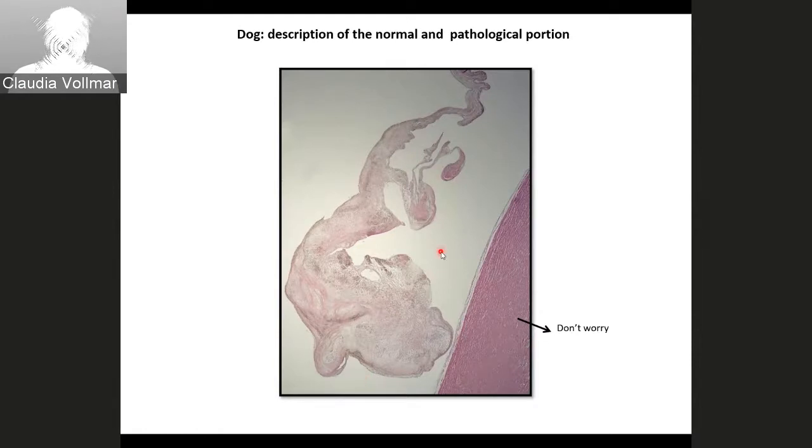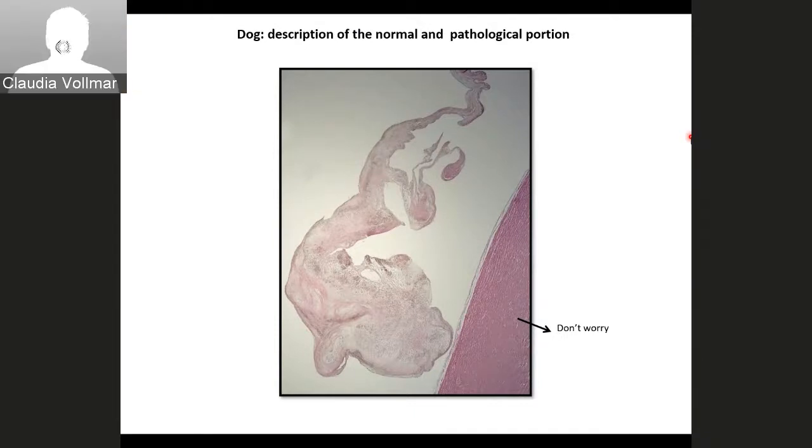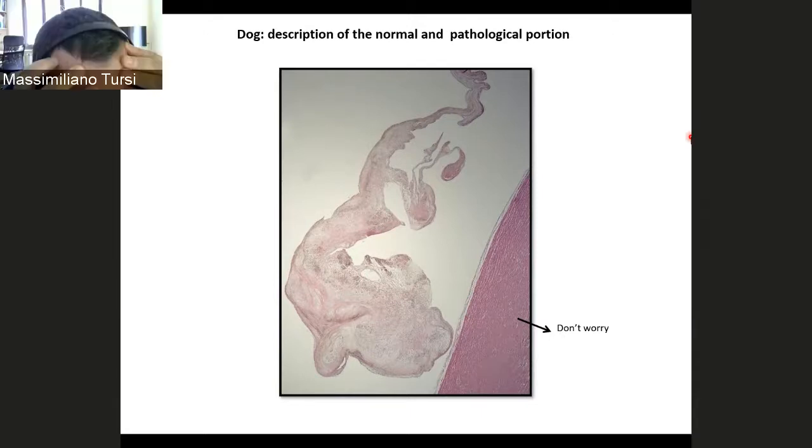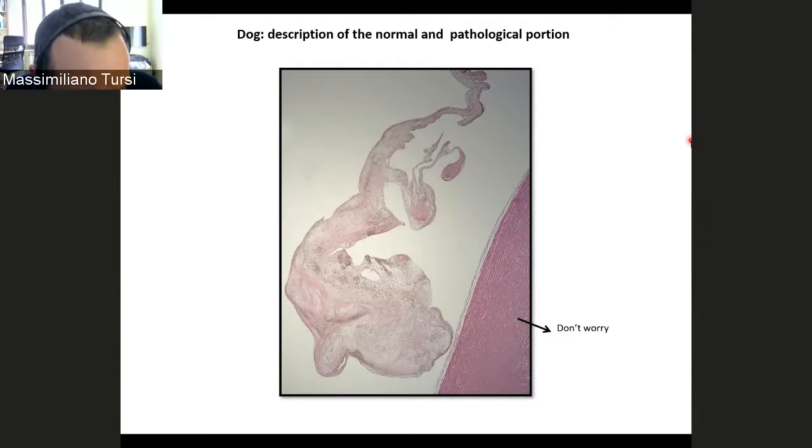Sure. So, say again the name of the histological diagnosis, because I didn't list it well. I'm sorry, Claudia. Degenerative mitral valve disease. Which kind of degeneration? Because if you say myxomatose degeneration, that's the key word. Myxomatose degeneration. And do you know what myxomatose means?